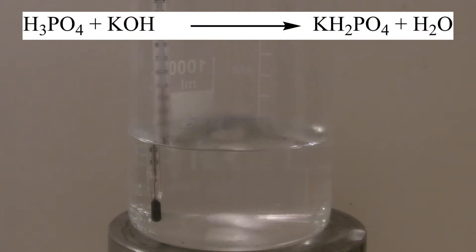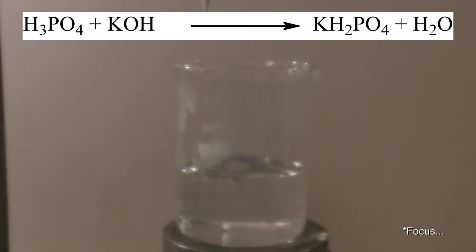Here a simple neutralization reaction takes place, where the phosphoric acid and the potassium hydroxide react to form potassium dihydrogen phosphate and water.